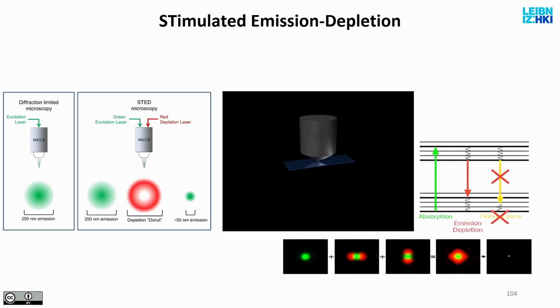Now, as a last thought, our biggest concern was resolution. Yeah? And the resolution depended on the numerical aperture, and that determined the size of the points that you want. So if I wanted to increase the resolution of my microscopes beyond what is given until now, what I would have to do is change the size of my points to something much smaller. But I cannot do that because diffraction limits everything to about 200 nanometers.